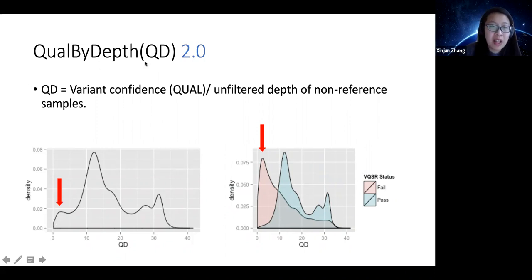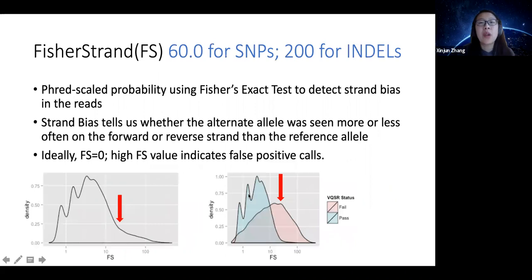So this is one filter that we figured out we can use, and we figured out where this 2 comes from. Similarly, we can use other summary statistics to figure out how to further filter things.